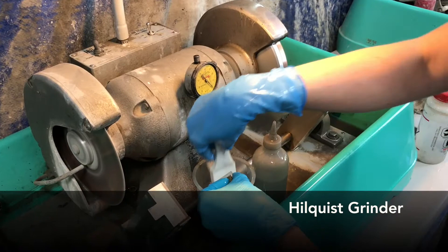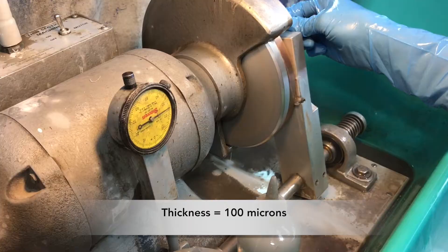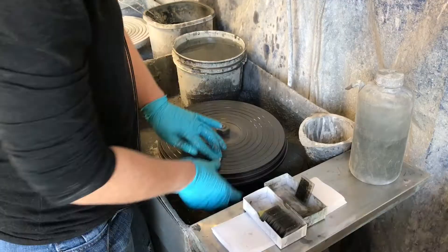Next, the slide is placed on the chuck of the Hillquist grinder. The design of this machine keeps the slide perfectly parallel to a vertical grinding wheel. Watching the thickness gauge, the technician incrementally guides the machine down to a thickness of around 100 microns.